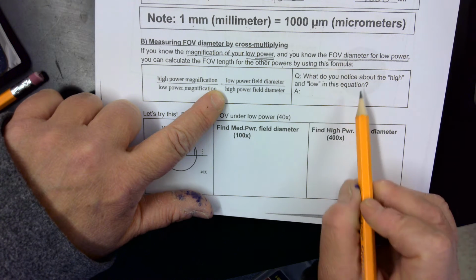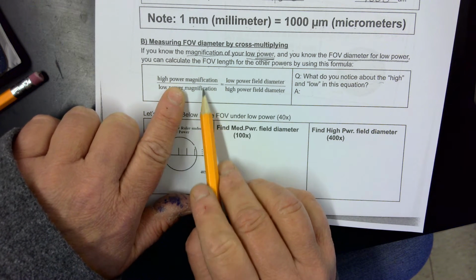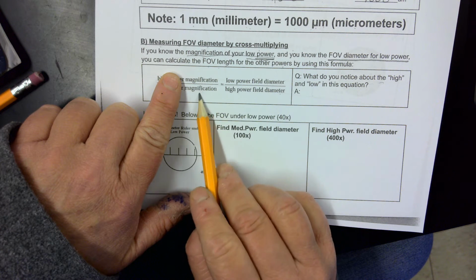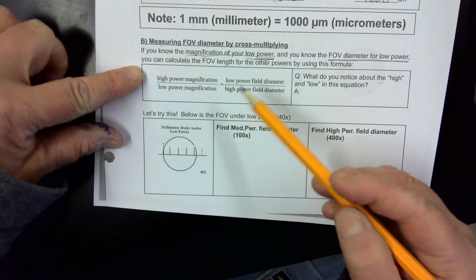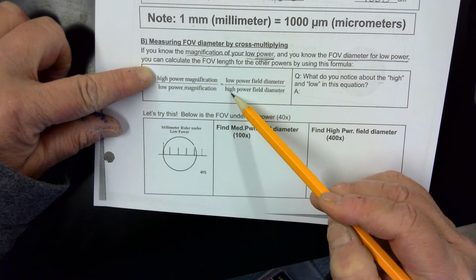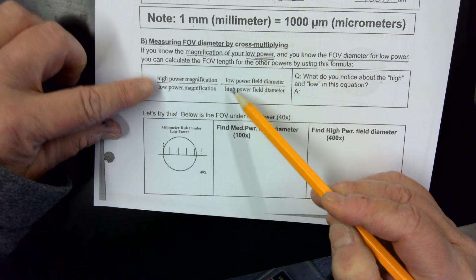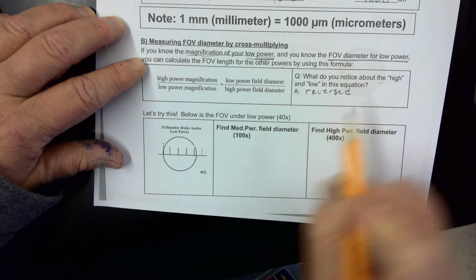So what do we notice about this equation? Magnification is on the same fraction and field diameter is on the same fraction, but notice that high and low, low and high: the highs and lows are reversed on either side of that fraction.